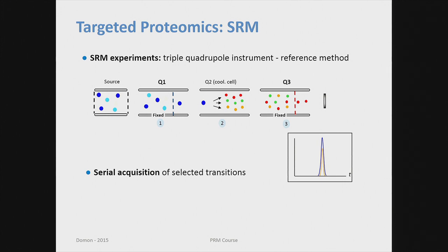You can measure several fragments, typically 3 or 4 for each peptide. If you do quantification, you have your internal standard. You measure the corresponding fragments of your internal standard. You get these ion chromatograms here, and then you quantify, as was shown previously, using the area under the curve, and then all the rules Christina and probably Brenda have discussed with you already.